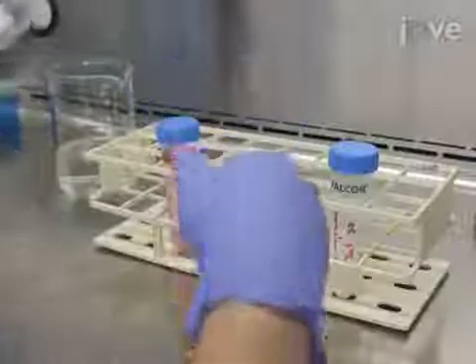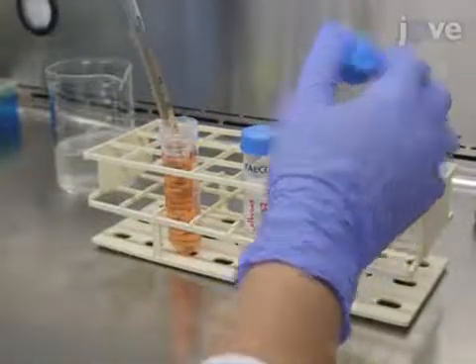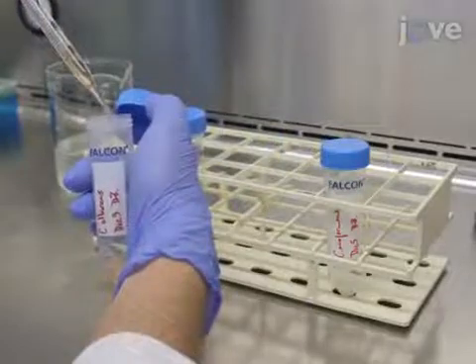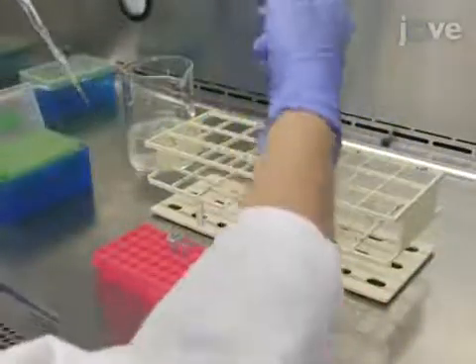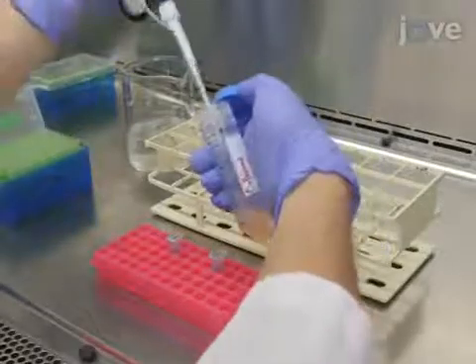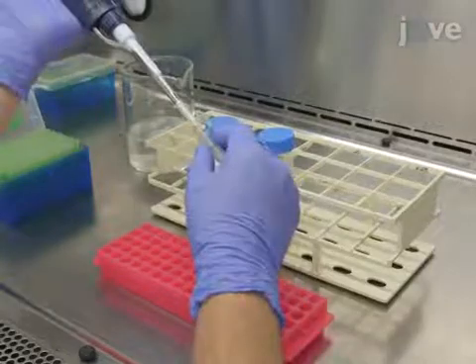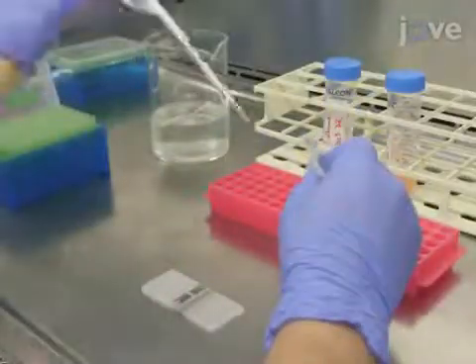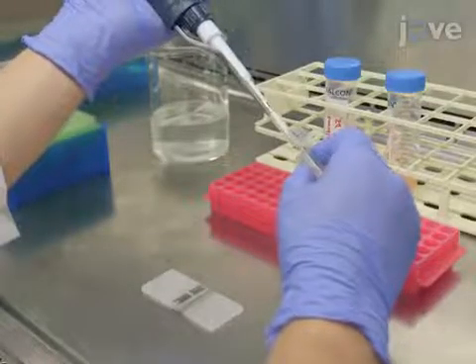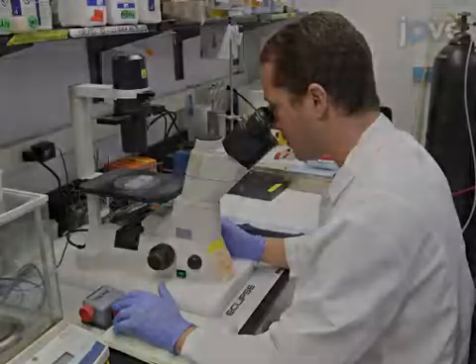After the third wash, re-suspend the cells in five milliliters of double strength RPMI 1640 medium. Depending on the turbidity of the cell suspension, prepare one milliliter of a 1 to 100 or 1 to 1000 dilution of each strain in a microcentrifuge tube. Aliquot 10 microliters of this dilution, place it in a hemocytometer chamber, and count the total number of cells in the four-corner quadrants.